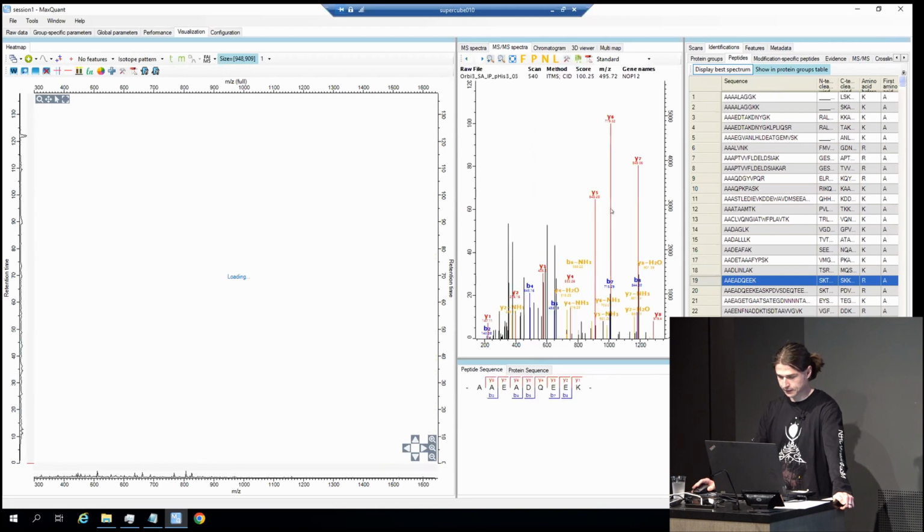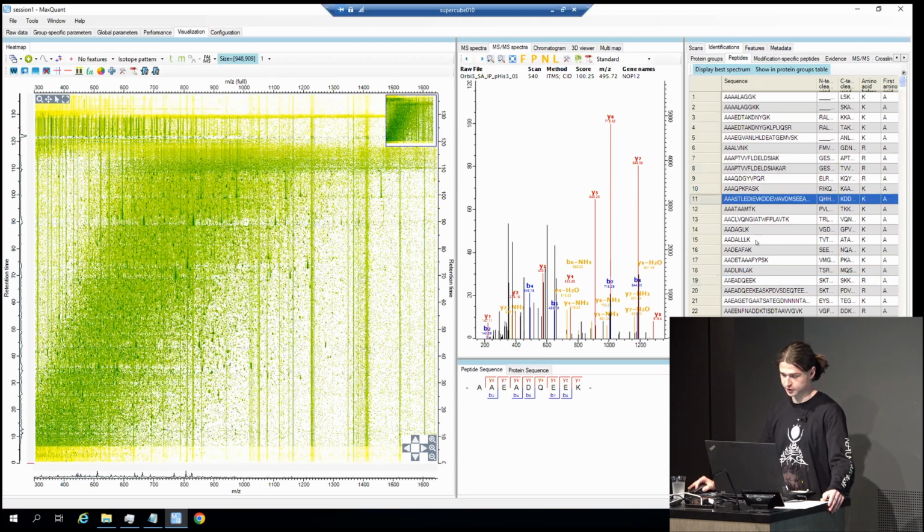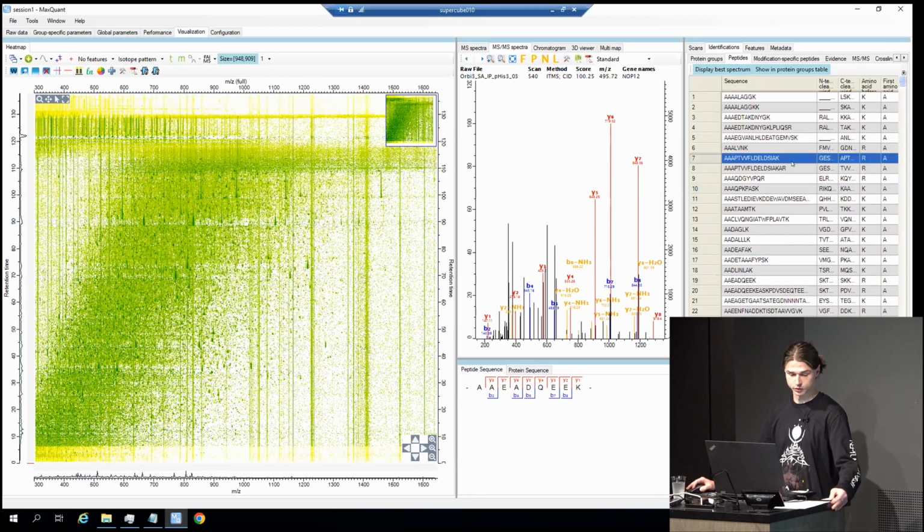And so if you want to go through the different rows of this table, it's best to switch this mode off, because otherwise that would take a lot more time. So if we turn it off, we can just go to some other rows without needing to redraw the picture anew. So good. What's next?